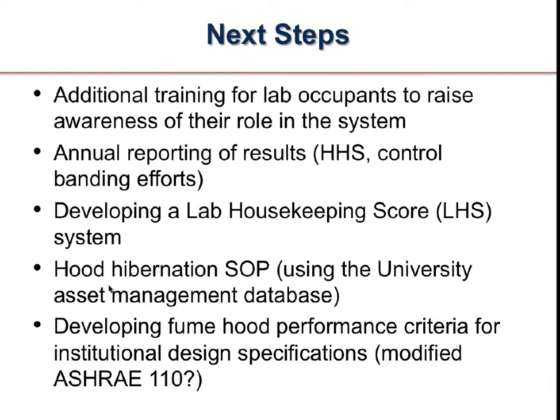The hood hibernation standard operating procedure: we have a university asset management database. This is the Maximo database. The practices for hibernating the fume hoods are pretty robust, but we're writing a standard operating procedure so that this actually lives within this database, because it makes it a system. And something that the ANSI Z10 says is that a system needs to be systematized. It can't be dependent on people.